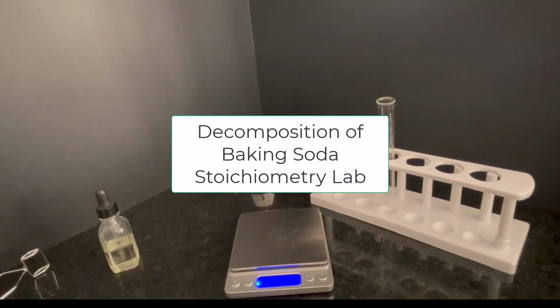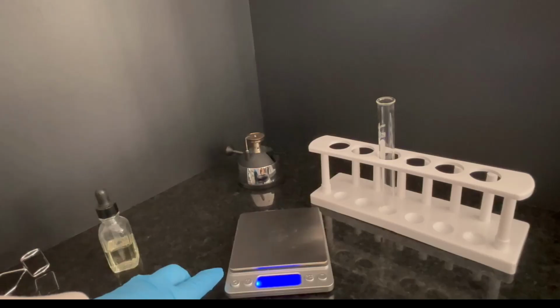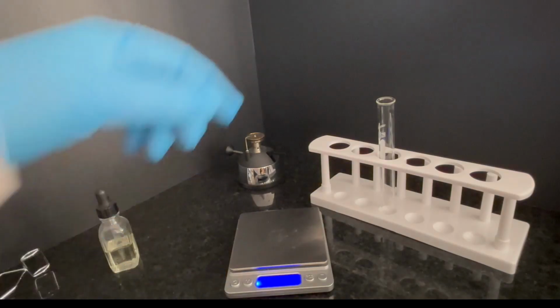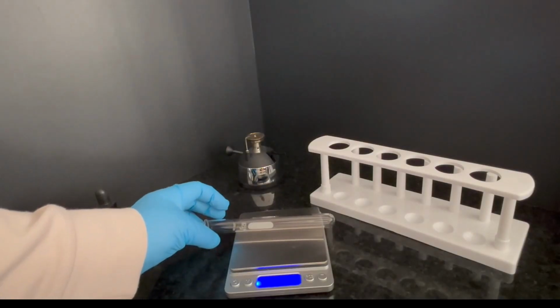In this lab, you'll use stoichiometry to predict a theoretical product and then calculate the percent yield based on the actual amount of solid product formed. The first step is to find the mass of the empty test tube.